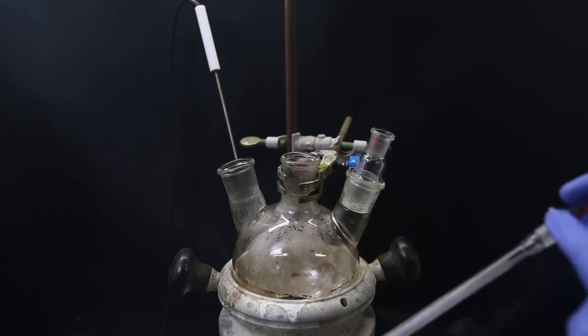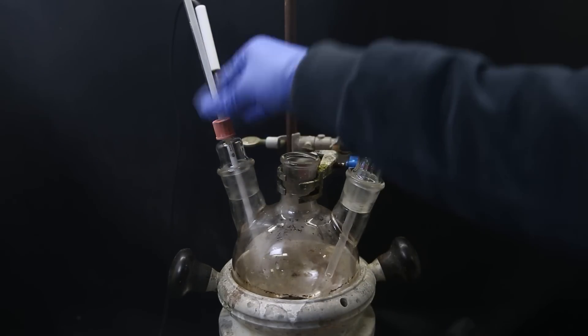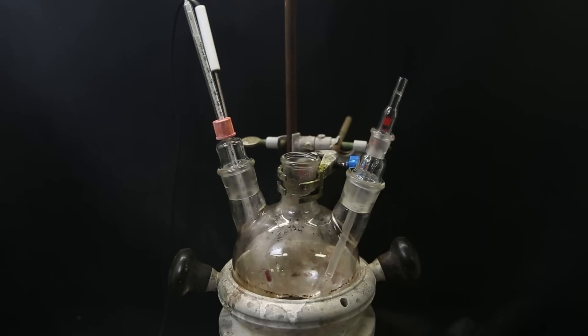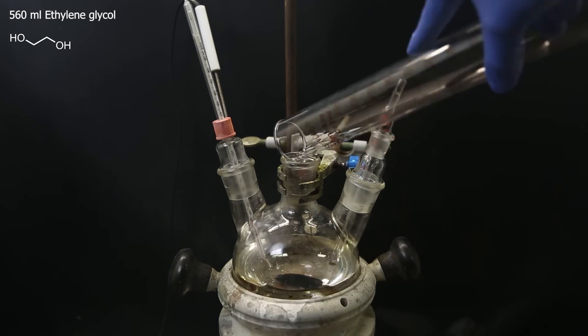On the right, I attach a gas inlet tube that will reach into the liquid. On the left, a thermometer to keep track of the internal temperature. Then as the first reagent, I add in 560ml of ethylene glycol, commonly found as antifreeze, and it is very cheap.